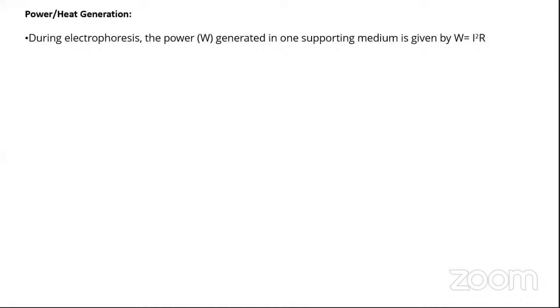Now we have talked only about the applied field, and its components, which majorly involve potential difference. That decides the speed with which the ions get conducted between the two electrodes. We also talked about how charge conduction is majorly taken care of by buffer ions, and the mobility of these buffer ions is also affected by the frictional coefficient. That leads to what is called heat generation.